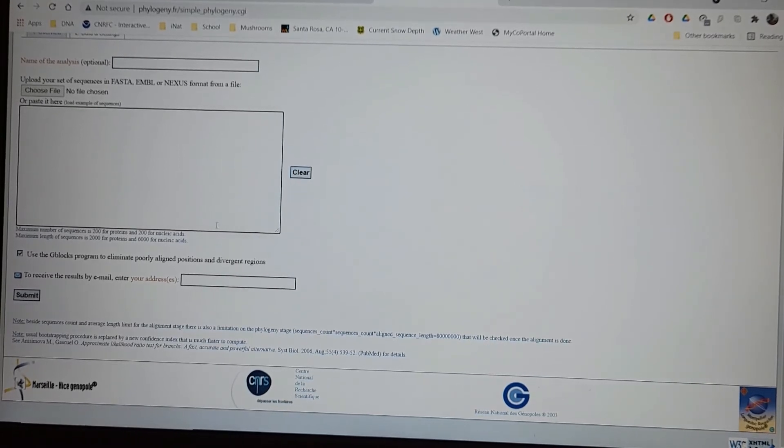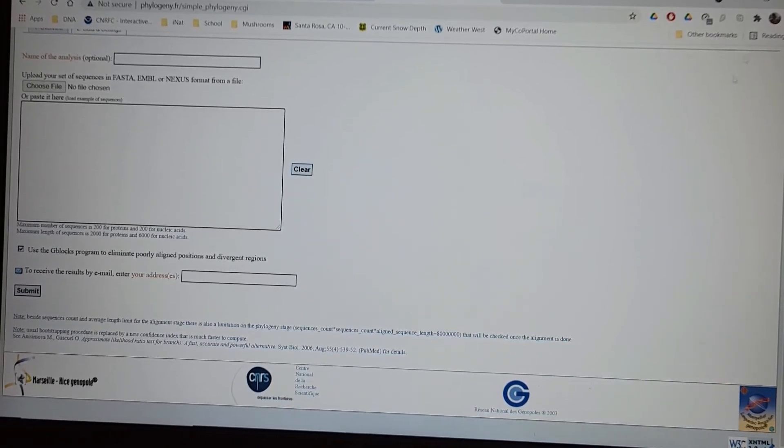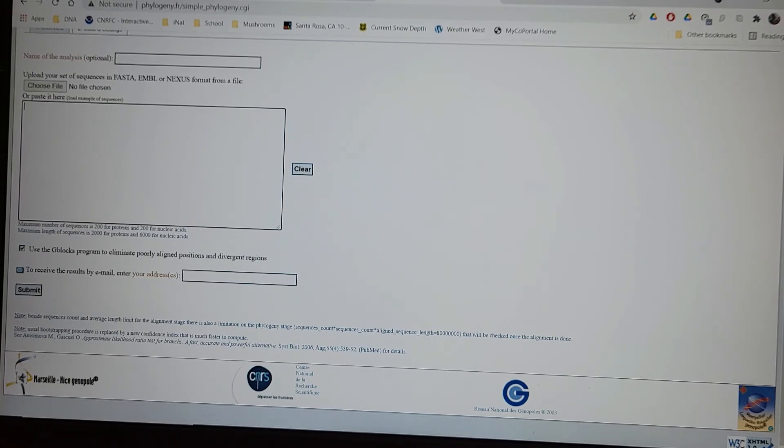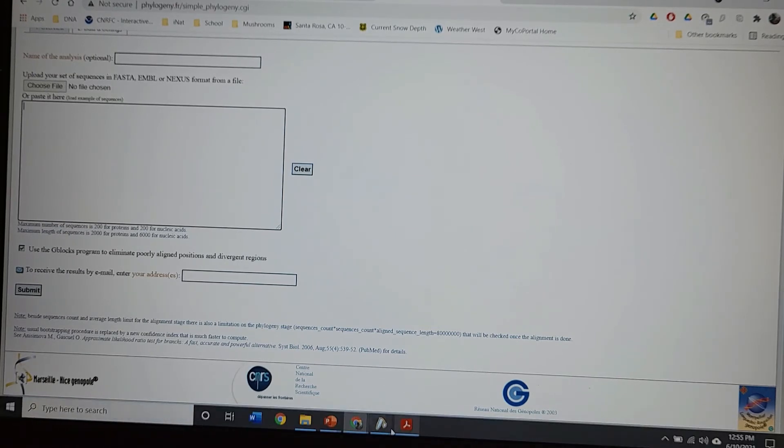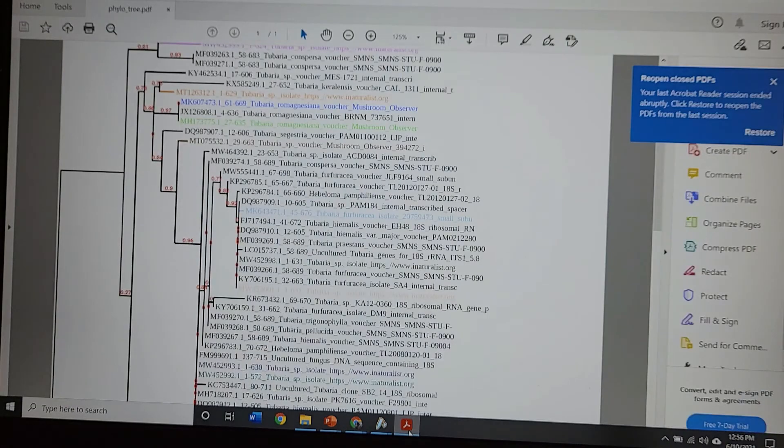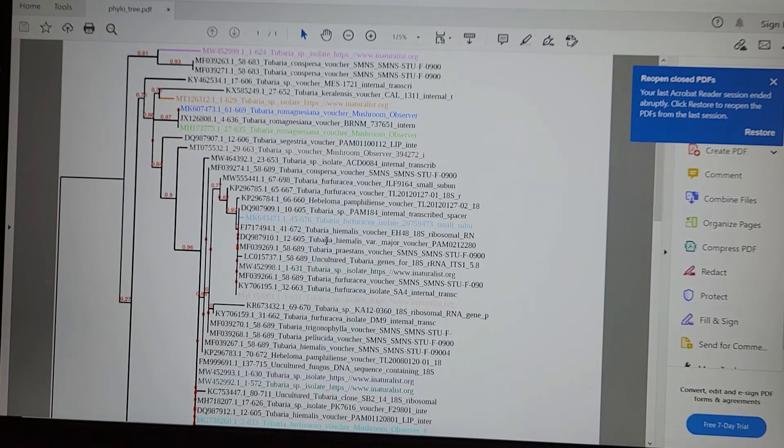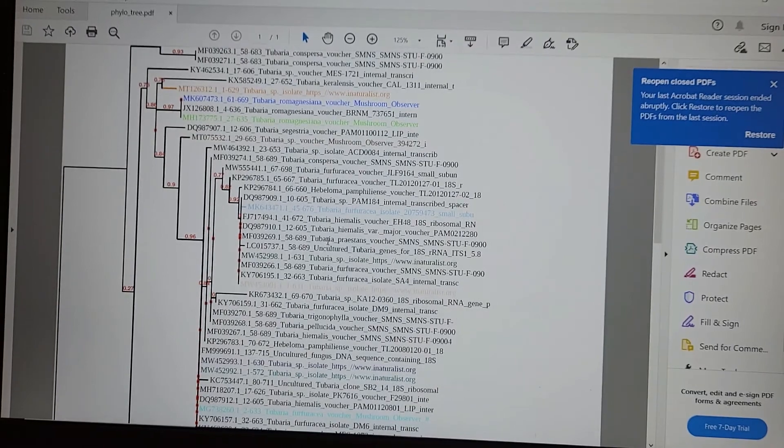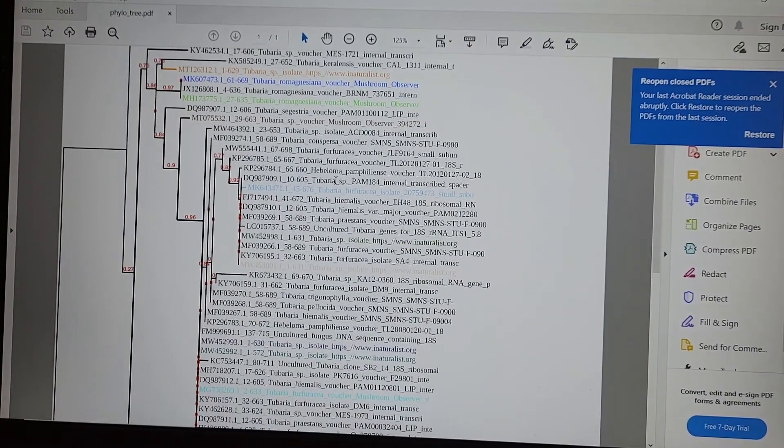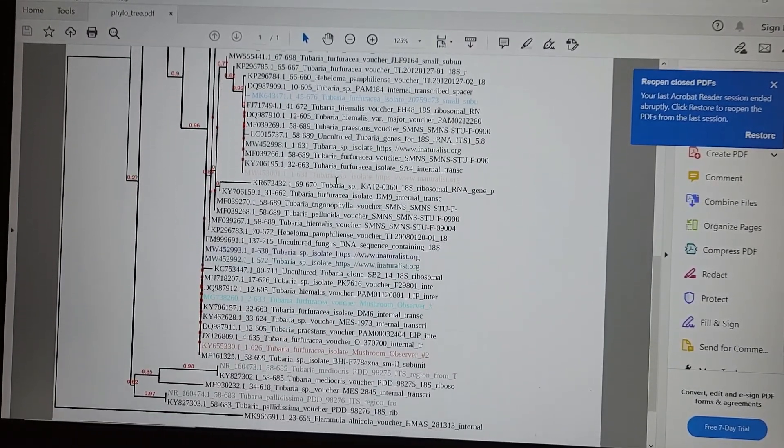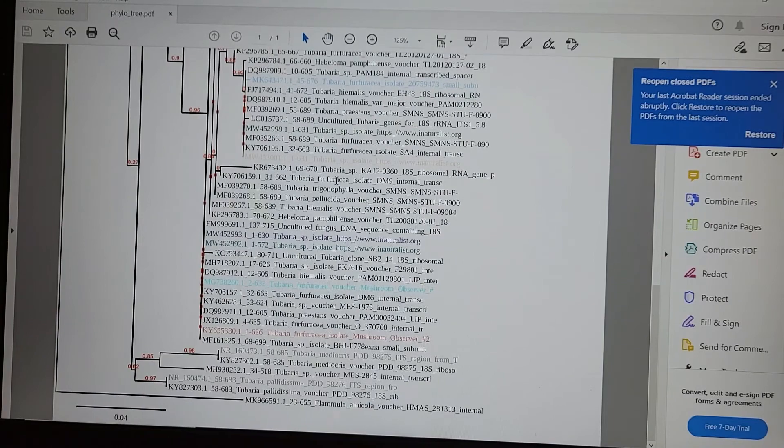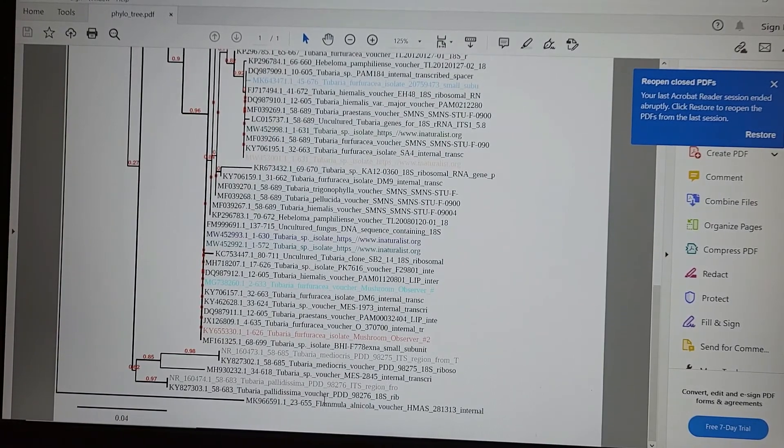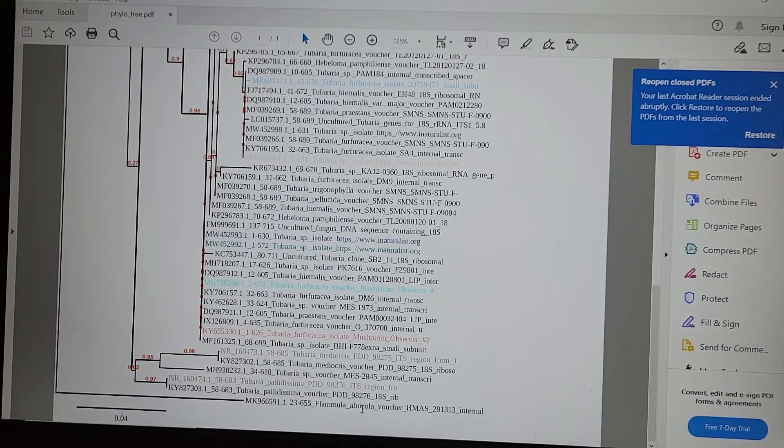And then what it'll do is it'll use the molecular data to do a bunch of different analyses and then put everything in a phylogenetic tree. So this is one that I did with tubaria. It's a genus of mushrooms, commonly grown wood chips.